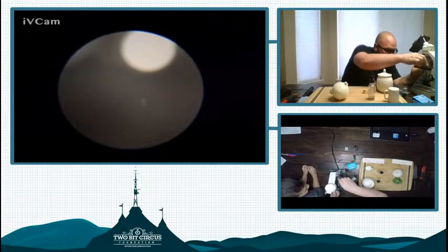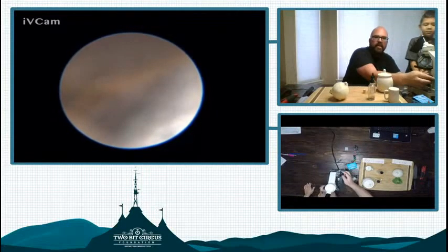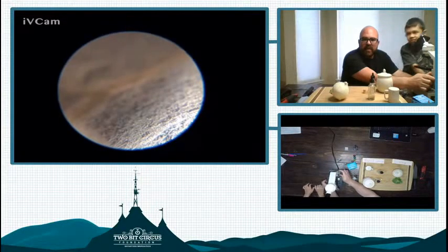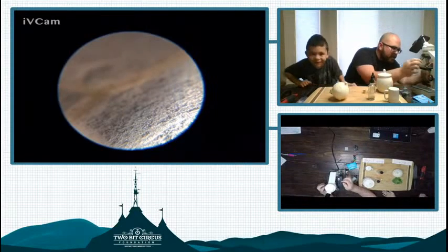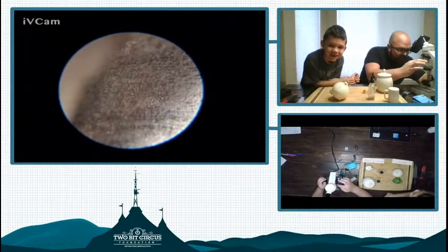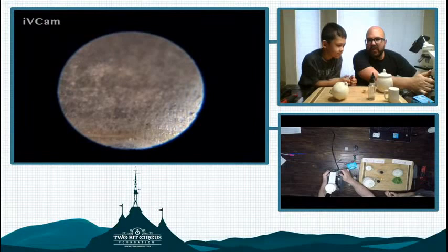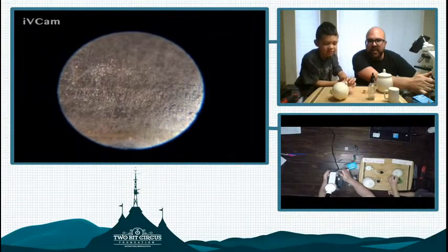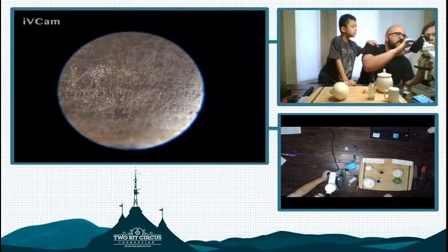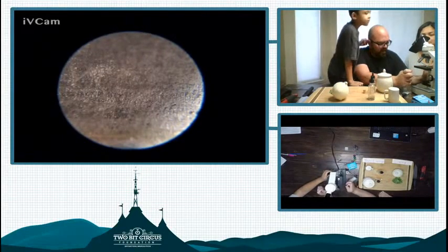Okay, so let's go ahead. I'm going to help you slide this slide under here, so we get a nice image. Hopefully we can get a nice image. And then we got to focus the microscope. I see like chip layers. It looks like a planet. I saw a little bit on there, huh? Something. So it's kind of hard because this isn't flat. Well, let's see what we see under here. It's living. Can you see it, Robert? And you can look at this closer view here too. Awesome.